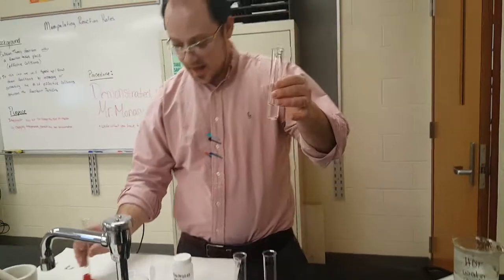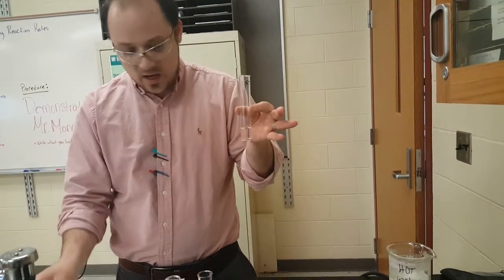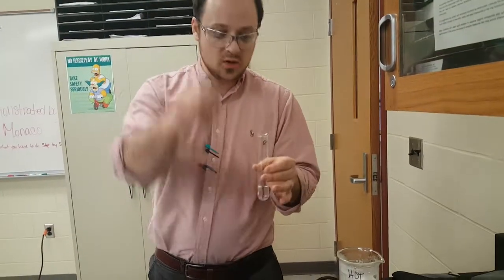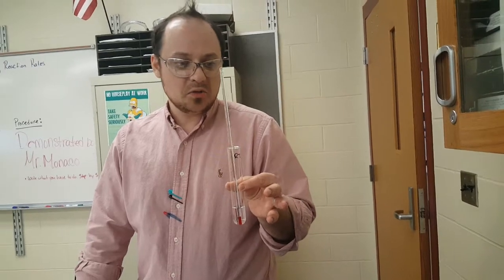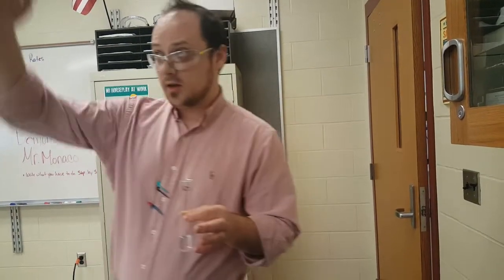So here's my 10 mils of acid. I want this one to be the room temperature one. This has been sitting out all day, all night, all week. It's already at room temperature. What is room temperature? Put a thermometer in there and find out, okay? It's about, in this case, looks like 22, 23 degrees. My data chart would be temperature, 22, 23, whatever it is, versus how long it took for this tablet to react.